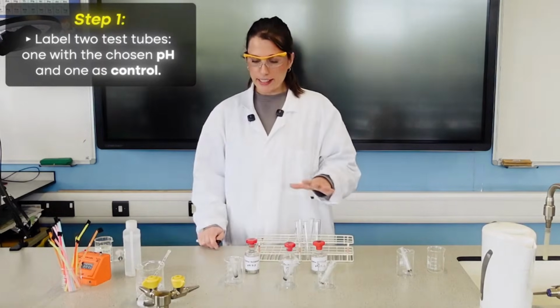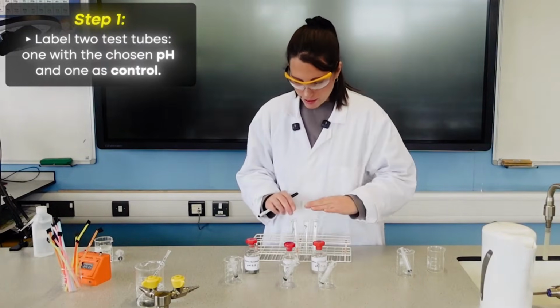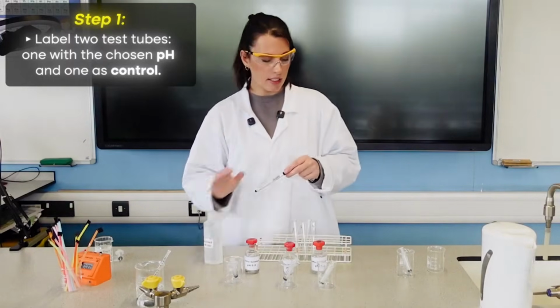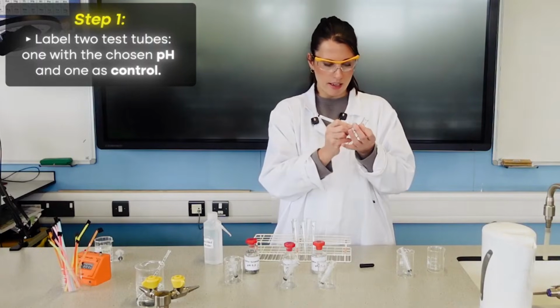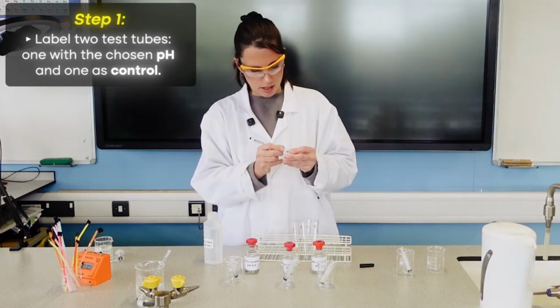So I'm now going to label my test tubes, and I've actually labeled 3 of them already, pH 4, 7, and 9, and those are going to be my test ones. But I also need my control experiment where I don't add the enzyme and I add the distilled water. So for this one, I'm going to call it C for control and 4, C for control and 7, and then C for control and 9.2.